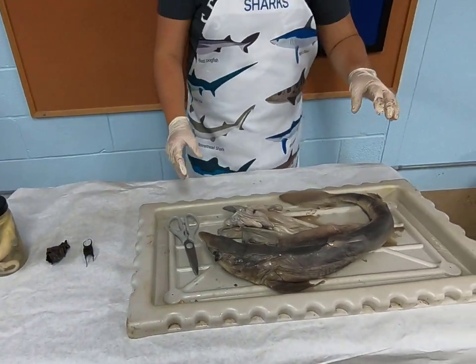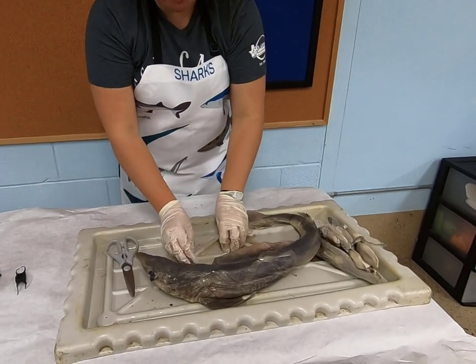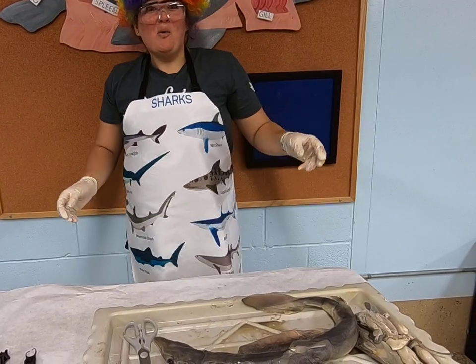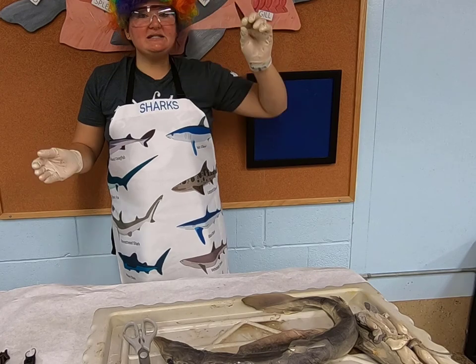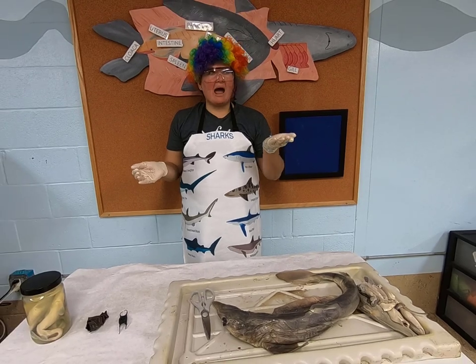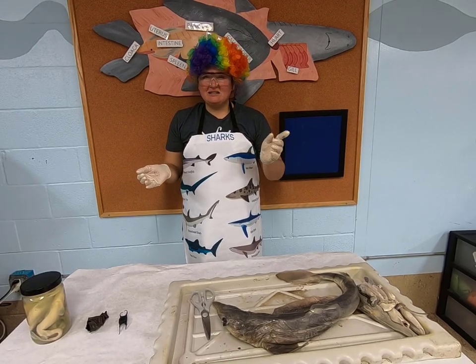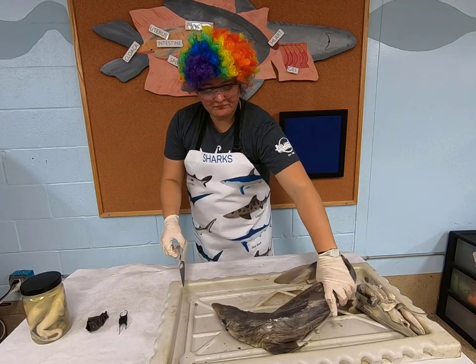Okay, now, the part you've all been waiting for. What does a shark's brain look like? Well, today we're gonna find out. So just like we did with the heart, I want you guys to imagine in your brains, or draw it on a piece of paper, or look at the palm of your hand, and say, I think this is how big a shark's brain is, right? And see if we can't bust that myth, and see if you are right.